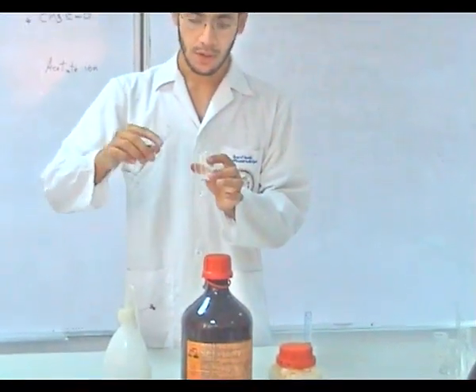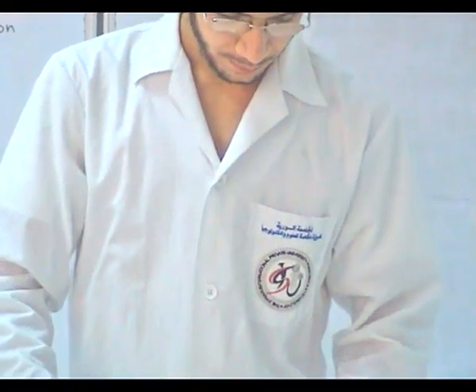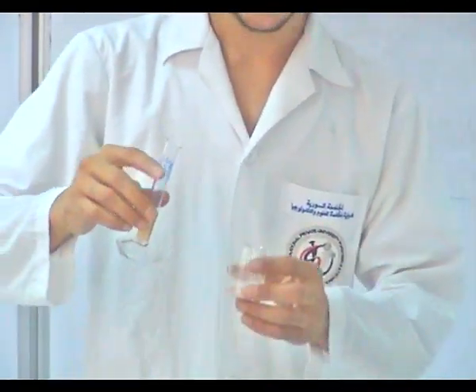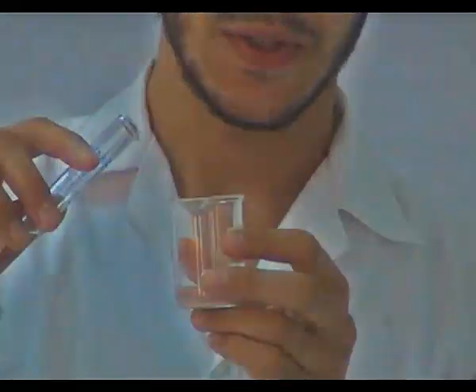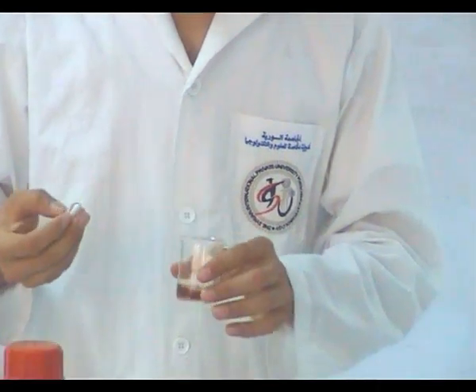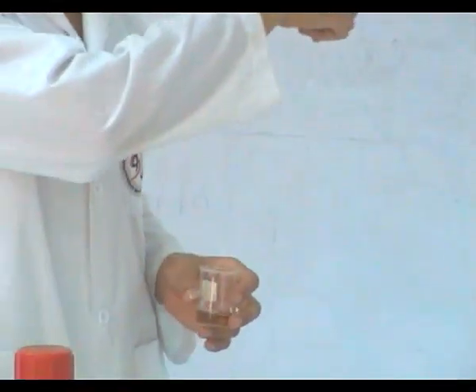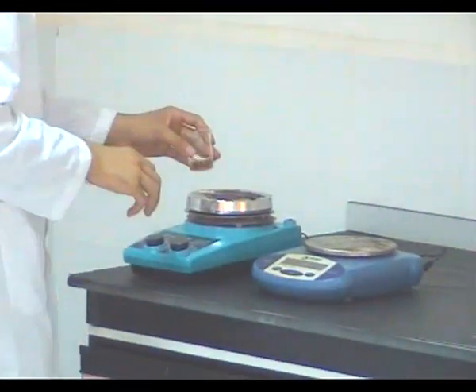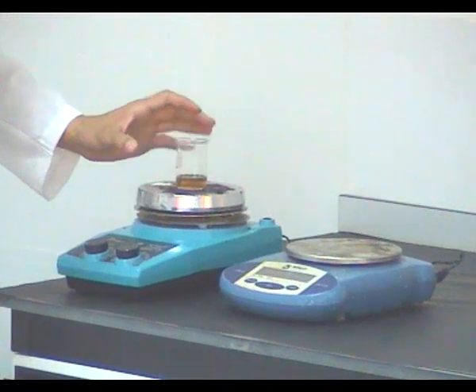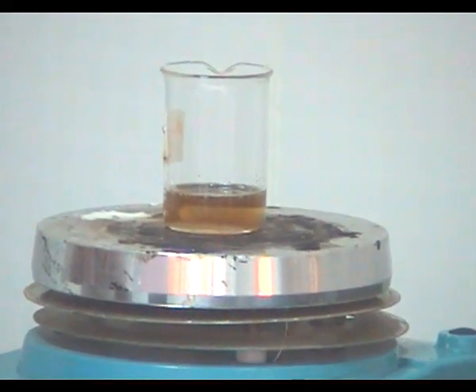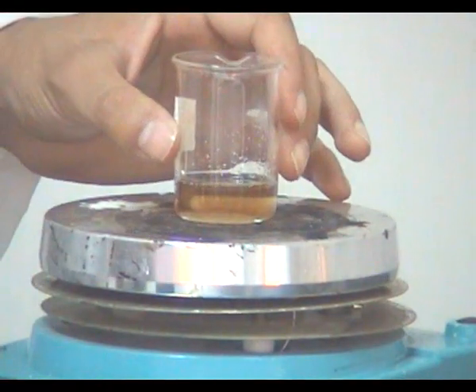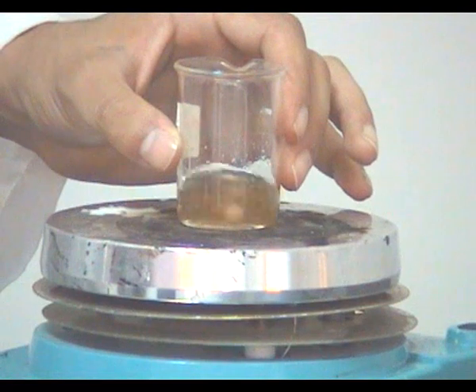We will dissolve the para-aminophenol in water first, and then we will add the acetic anhydride slowly. Note that this reaction is exothermic — caution! Do not add all the acetic anhydride in one step. After adding the acetic anhydride, we will place it on the magnetic stirrer and stir until the solid mass is dissolved, then stir for an additional ten minutes to ensure the reaction is completely done.